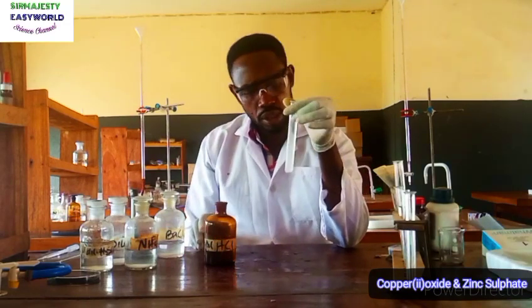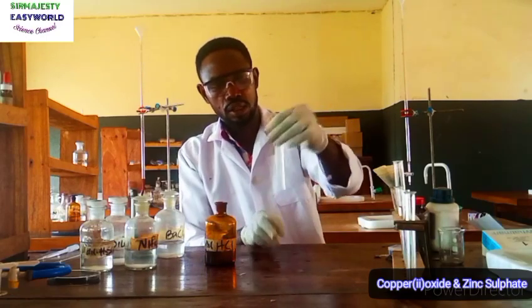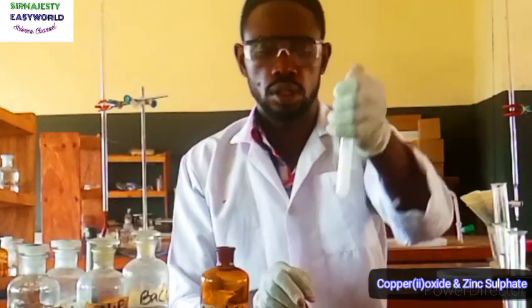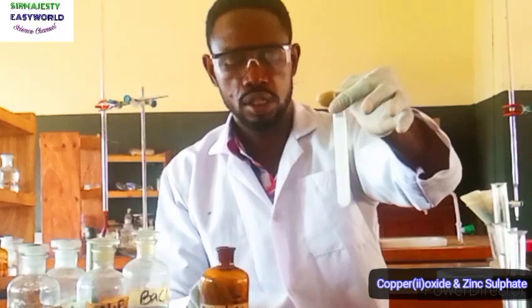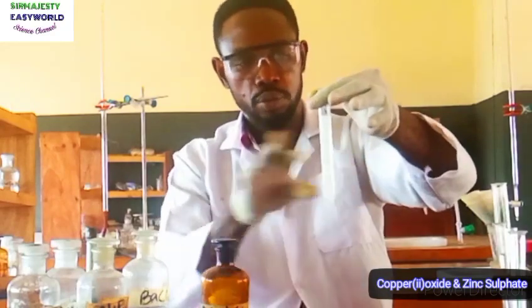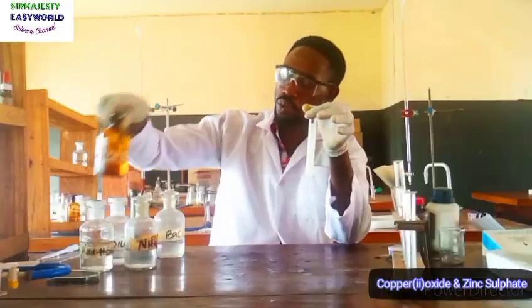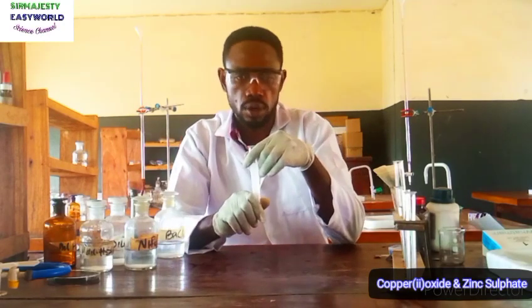Let's check. The precipitate is just dispersed, not dissolving. If you look here, it is still there. See, it is still there. So the precipitate persists, it is not dissolving, it remained milky as it was before. That means what is present here is tetraoxosulphate 6 ion.